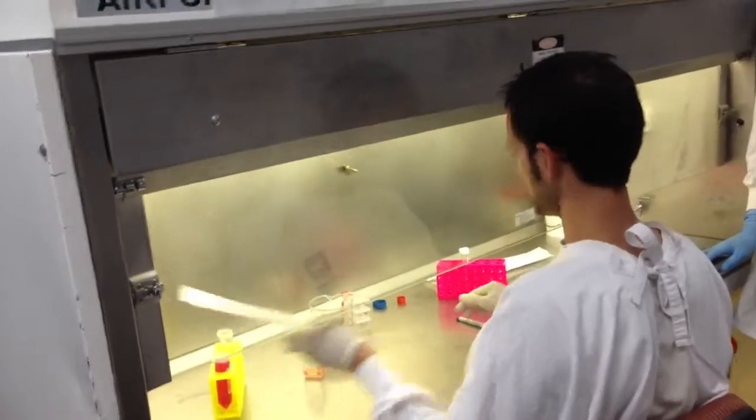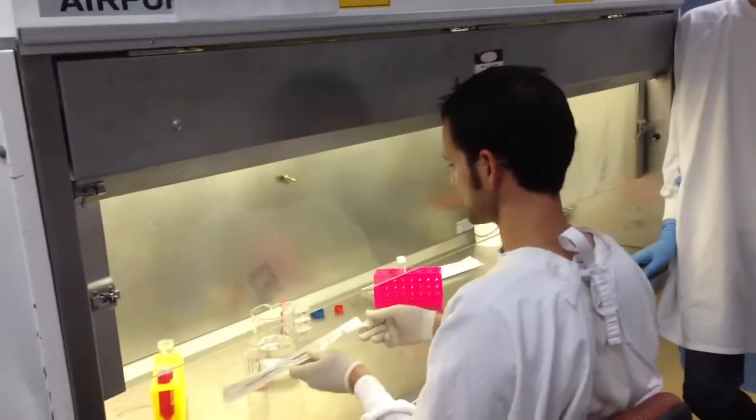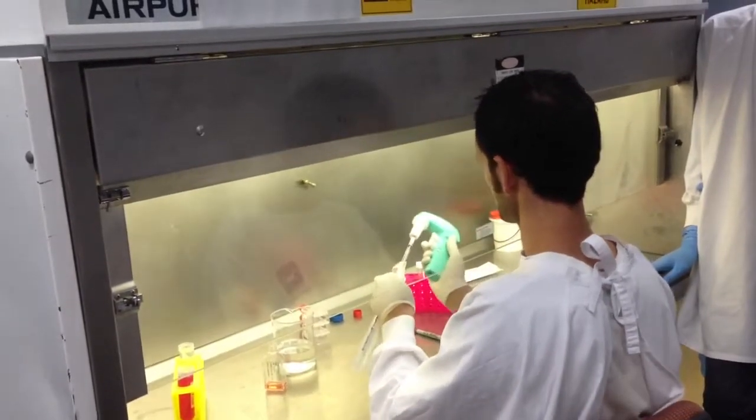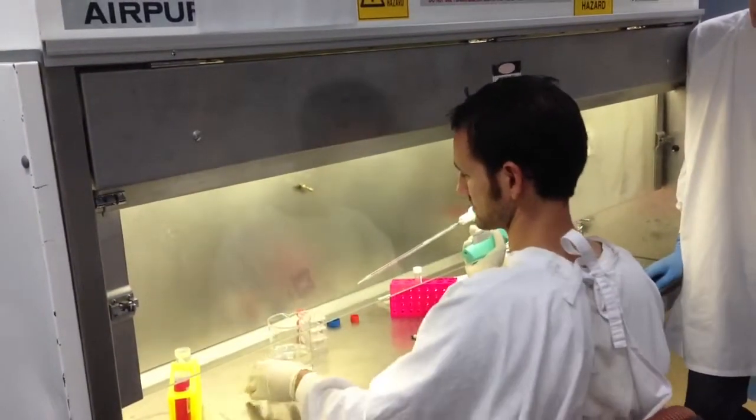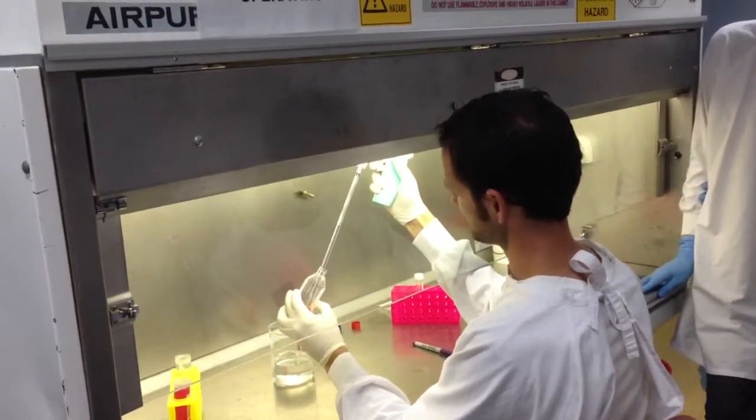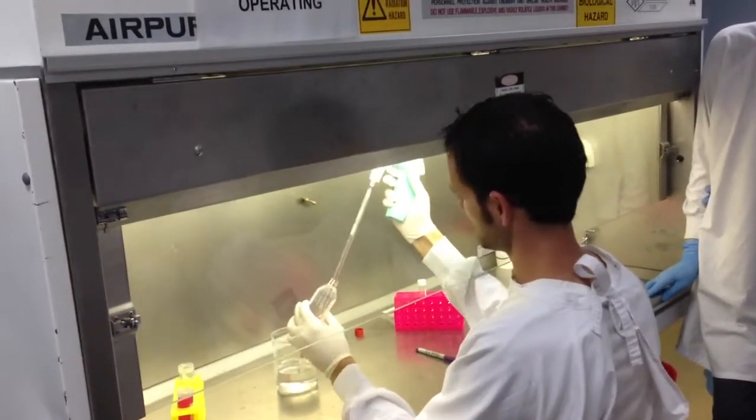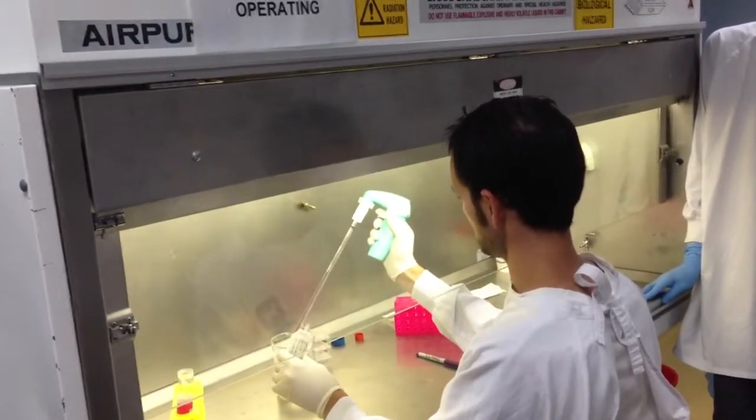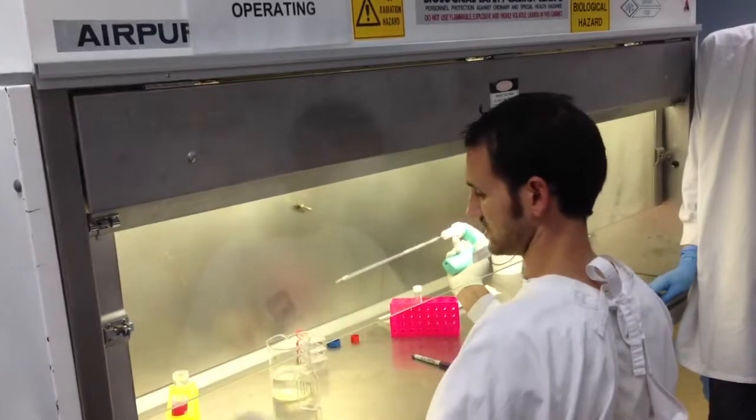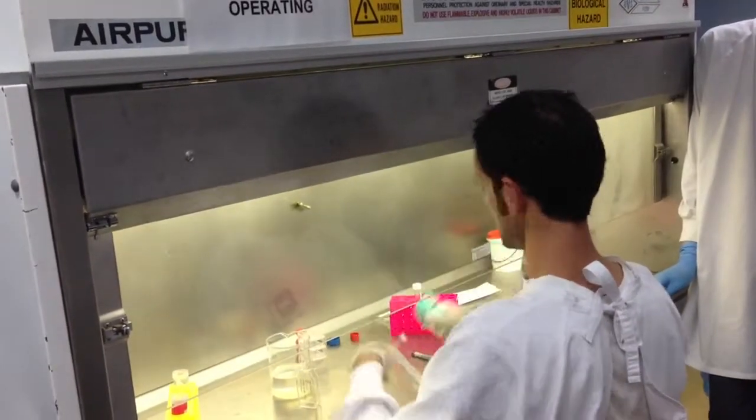The first step is to remove the spent media. Put it down the bottom corner. We want to sterilize that, so put it into the ethanol. I don't want to use this pipette again because it's contaminated.